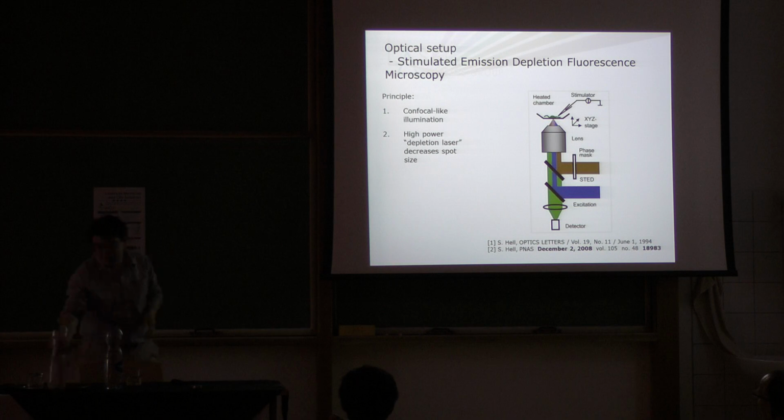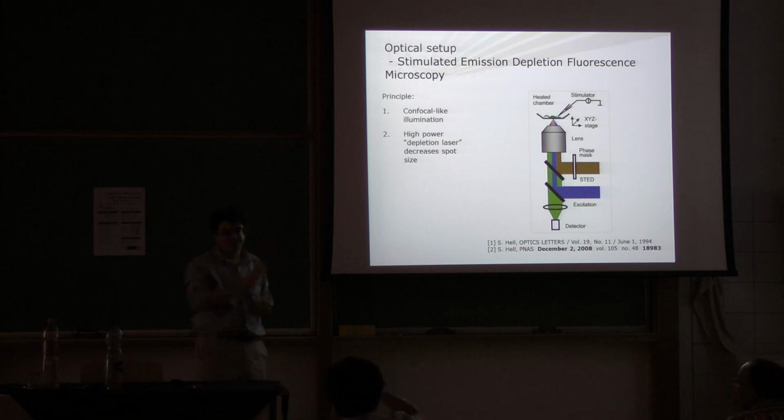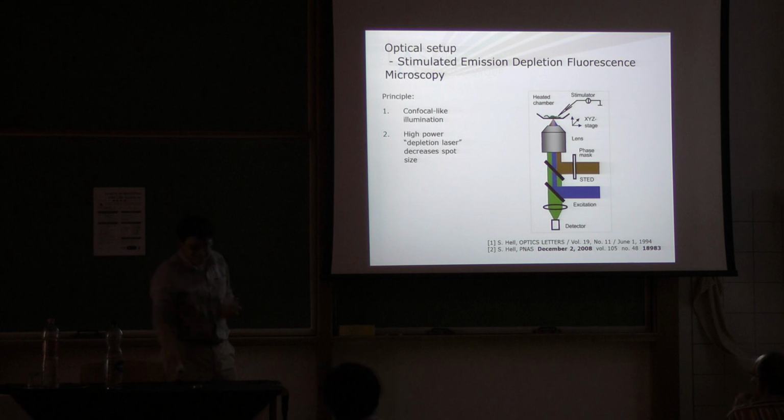What do you know already about epifluorescence and confocal fluorescence microscope setup? Would you like me to outline that, or do you want me to do something more complicated? For example, here, where is the incident ray?